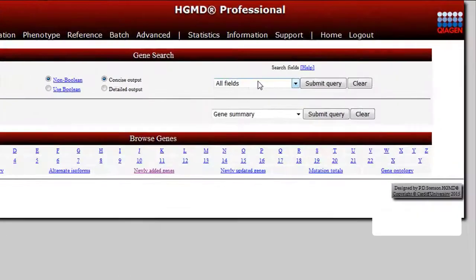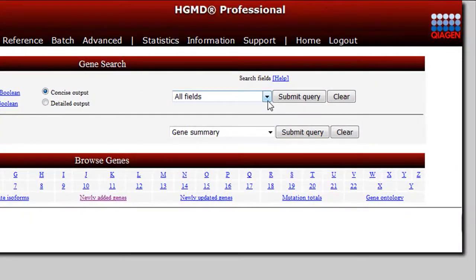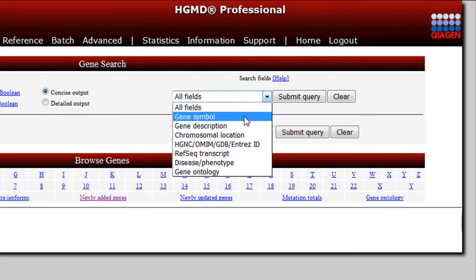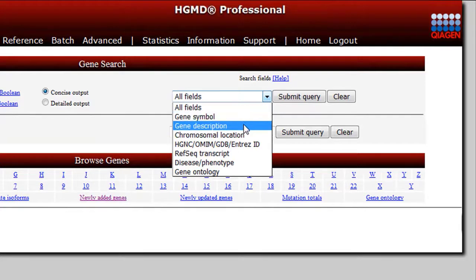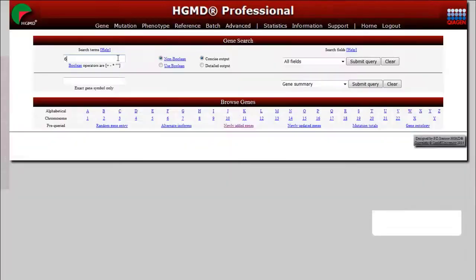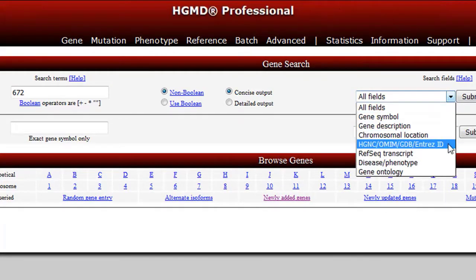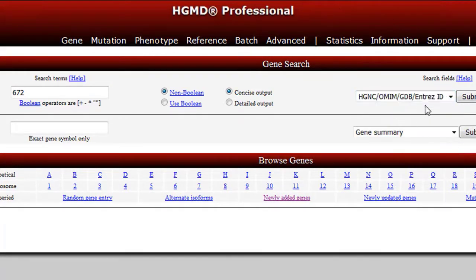For a more specific search when the gene symbol or gene description is known, select the gene symbol search or gene description search. If a common public identifier is available, for example ENTREZ ID 672, use the HGNC OMIM GDB ENTREZ ID option.